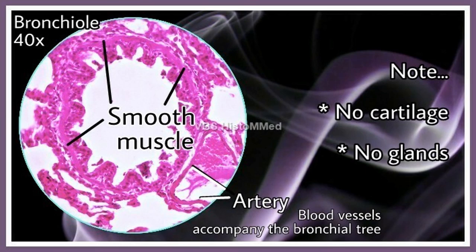Now the signature features of the bronchiole: smooth muscle is present in the bronchus too and in lower areas, but the bronchiole stands out primarily because there is no cartilage and no glands. The sero-mucus glands mentioned in the previous video on intrapulmonary bronchus are absent here. No cartilage and no glands are the two important negative signature features that accredit the identification of the bronchiole.